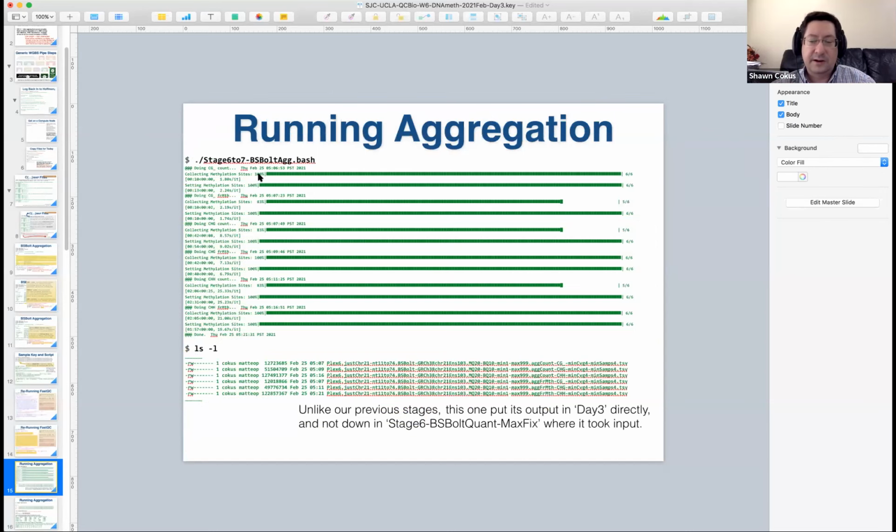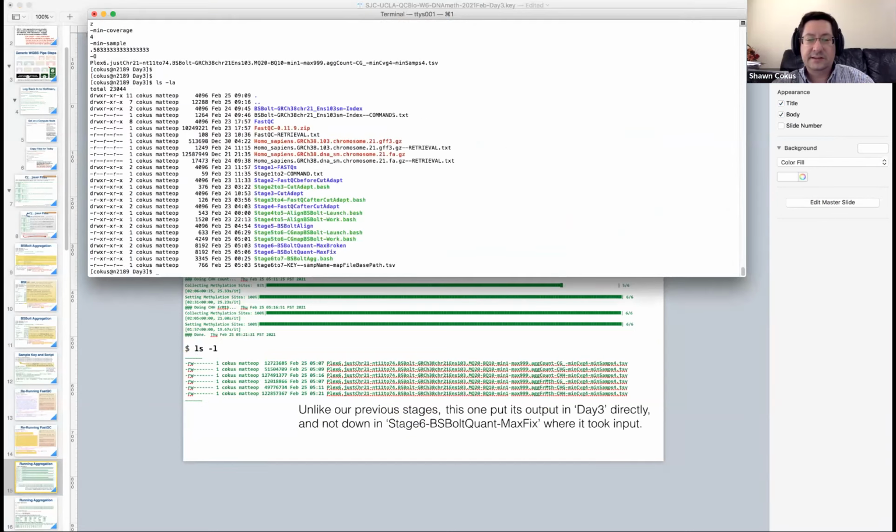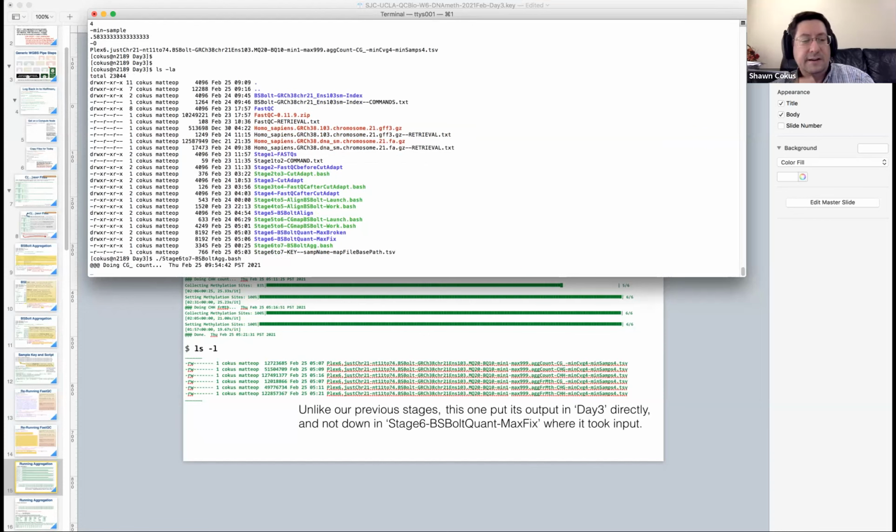Okay, so now we can run it. Why don't you guys run it, right? So this one doesn't need arguments because it's the merger of all the files, and it just grinds, right? We don't have to tell it to do each thing individually. This is the merger of them all. So there are no parameters to this thing. We just run it. Okay.